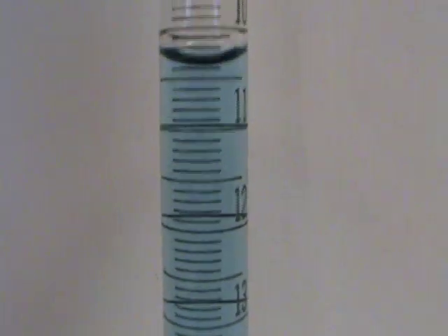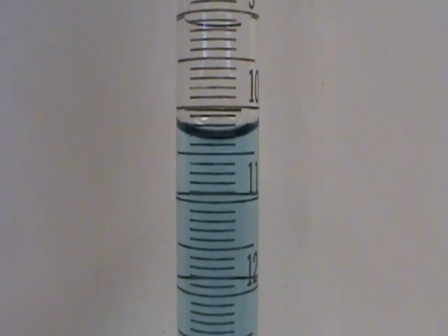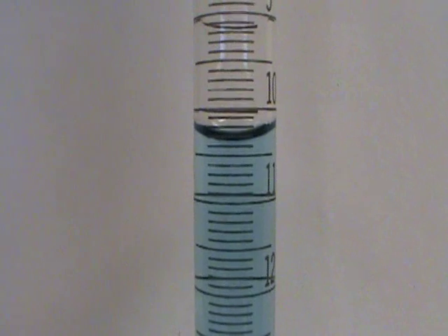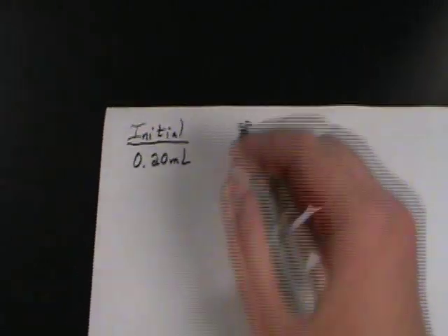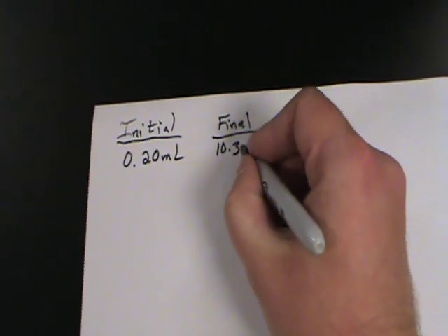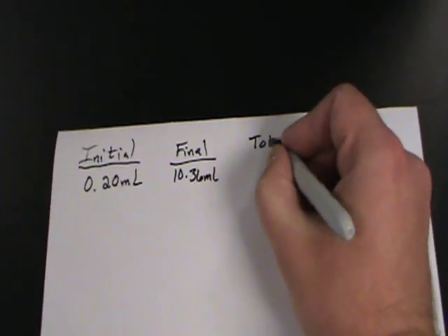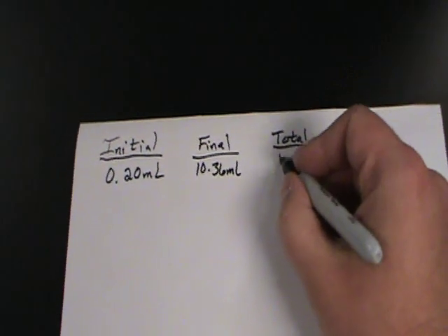We drain down to just below 10.00. Now how far below 10.00 are we? Let's get a little closer, at the right height so we're not looking up or down. That looks like 10.36 milliliters. So our initial was 0.20 milliliters, our final reading was 10.36 milliliters, which means that our total was 10.16 milliliters delivered.